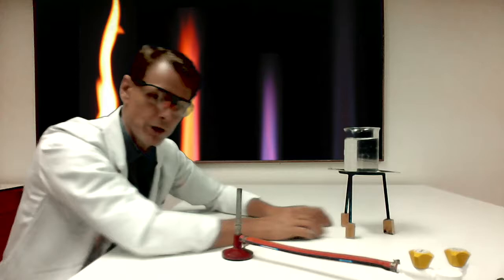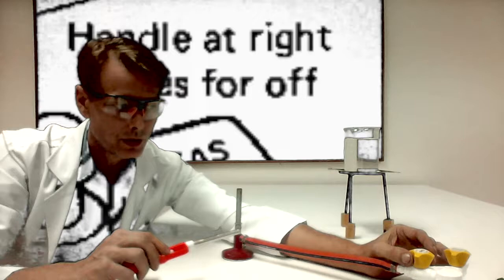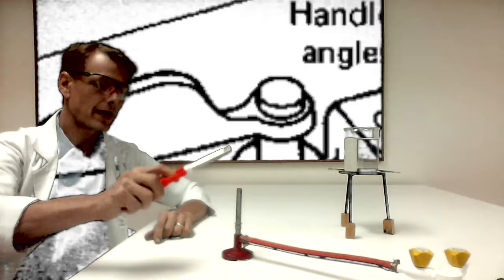To light it safely, what you do is you turn it with the lighter in hand and ready. We have nice new valves on our gas supplies. You have to lift it, can you see that? Lift it just a little bit, and then turn it counterclockwise or left. Left makes loose. Then stand back, hair out of the way. Would not want your hair involved with that little flame.